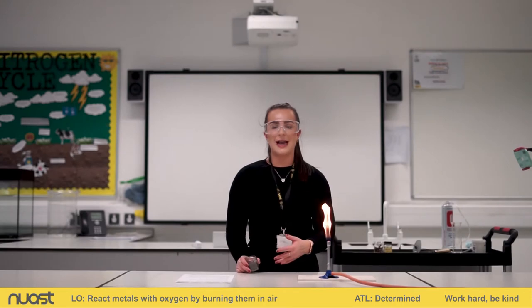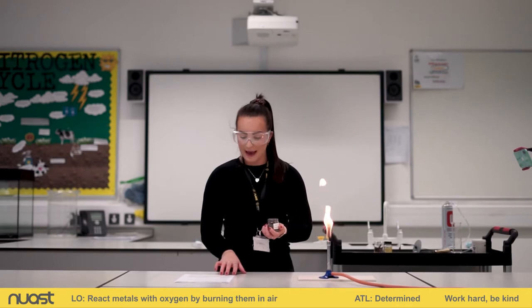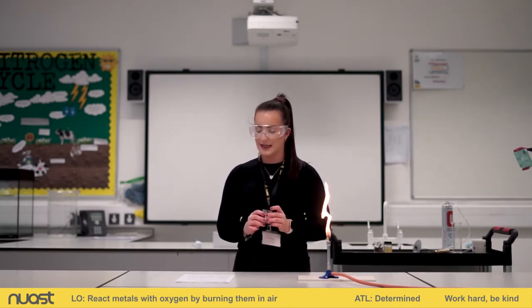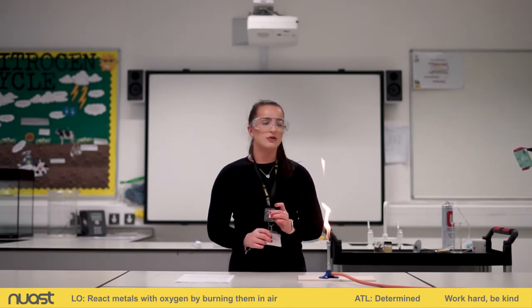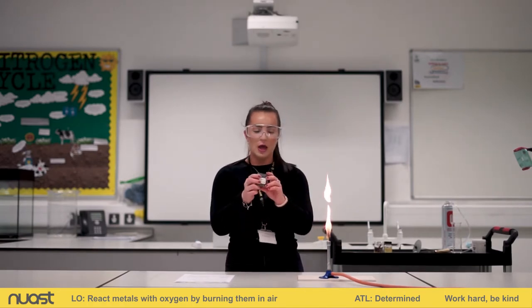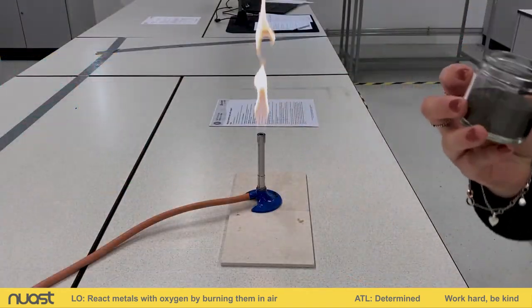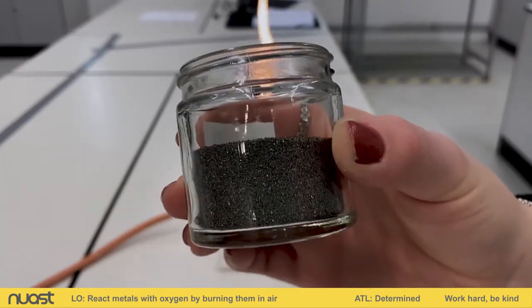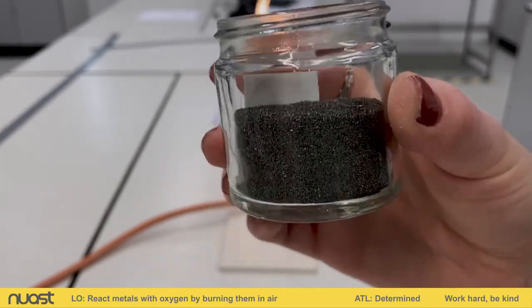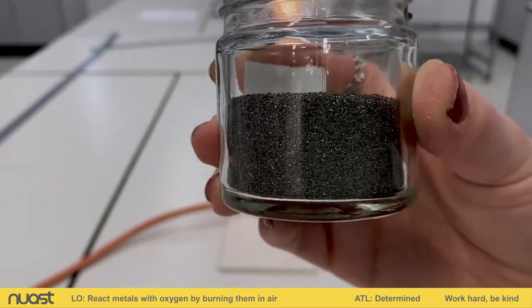Okay, so we're going to go on to our next metal now, and we're next going to go on to iron filings, okay? So on my method, it says when reacting iron with oxygen, sprinkle iron filings into a tilted Bunsen flame. So that's exactly what I'm going to do. I am just going to hold these up to the camera so you can have a look at what the iron filings look like before they've reacted with the oxygen. Okay, so hopefully you can see there that they've got this dark grey, nearly black, but slightly shiny colour.